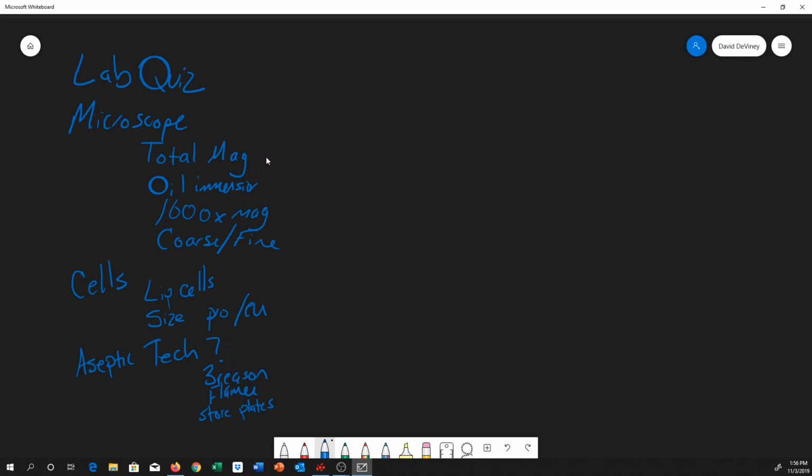I might ask you up here in the microscope stuff, a short answer could be just to walk me through the process of using the oil and the oil lens, and then how do you correctly clean up from that. So that's another possible short answer question.